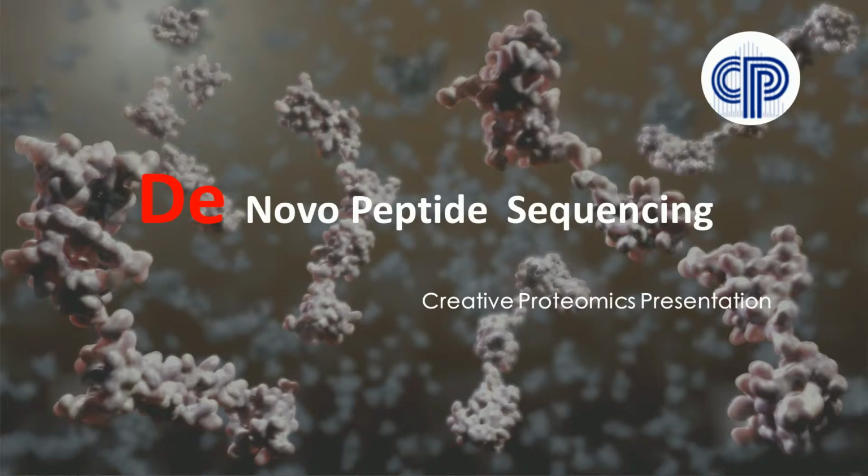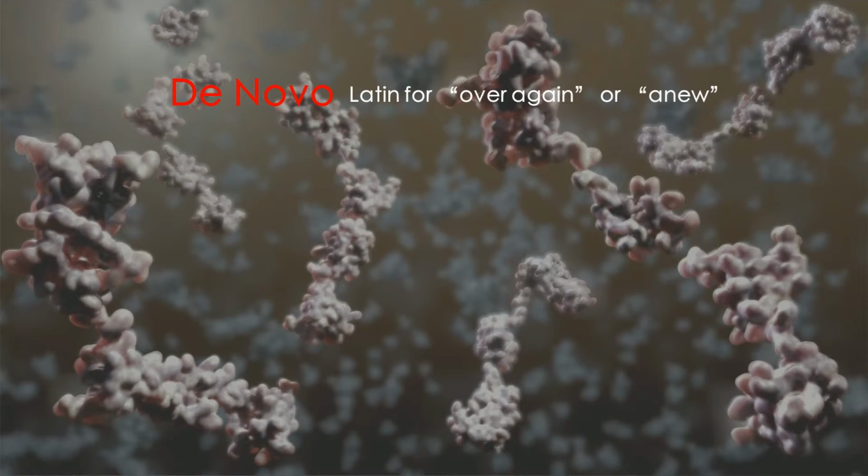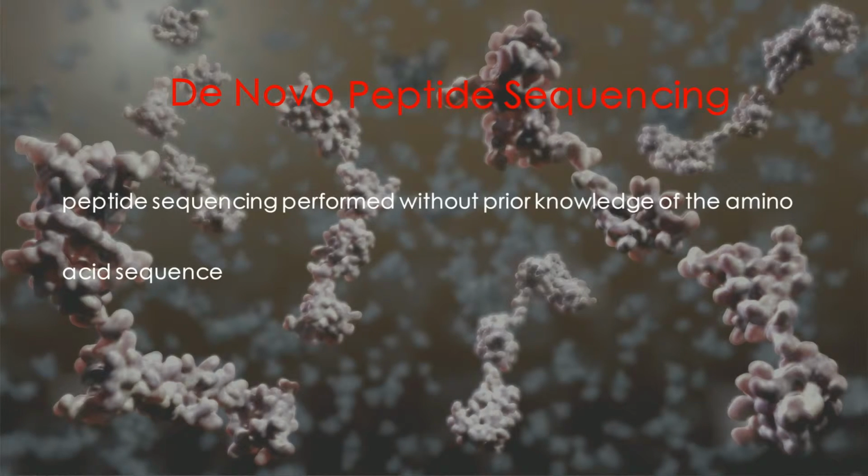As we know, tandem mass spectrometry is one of the most powerful tools for protein identification. Today, we are going to learn some basic knowledge about de novo peptide sequencing. De novo is Latin, which means over again or anew. De novo peptide sequencing is a method for peptide sequencing, performed without prior knowledge of the amino acid sequence.